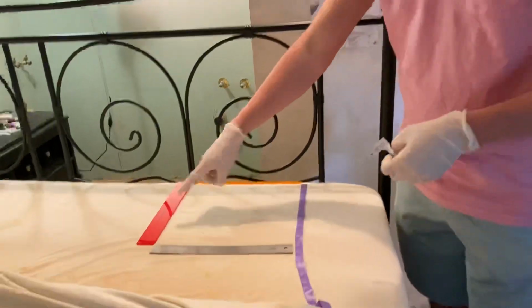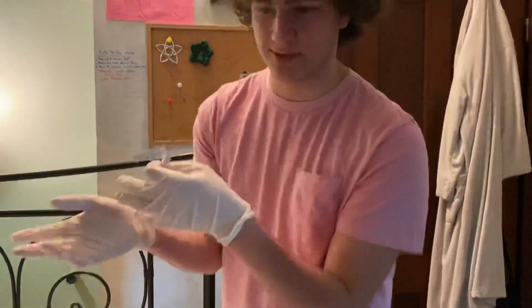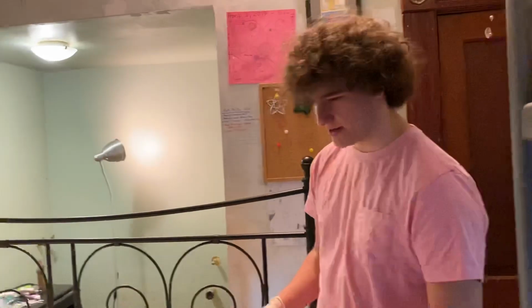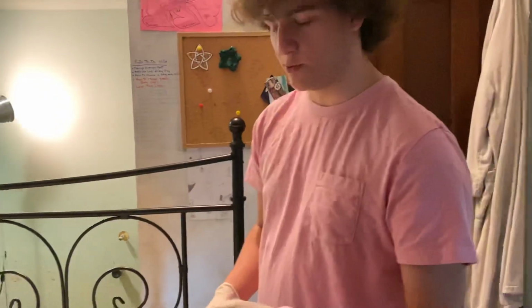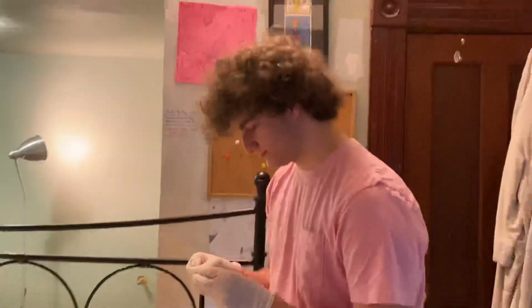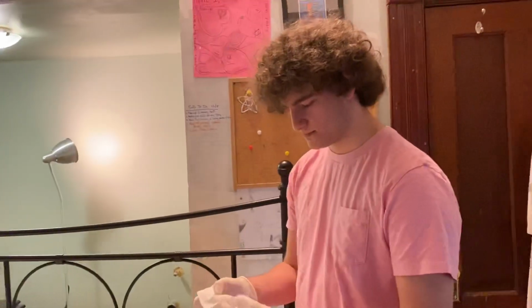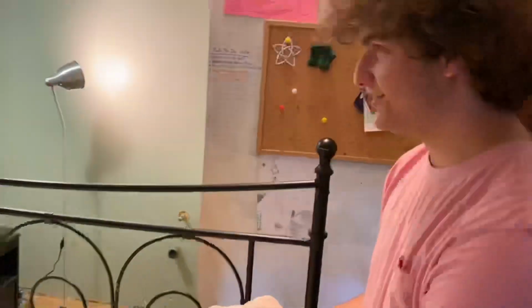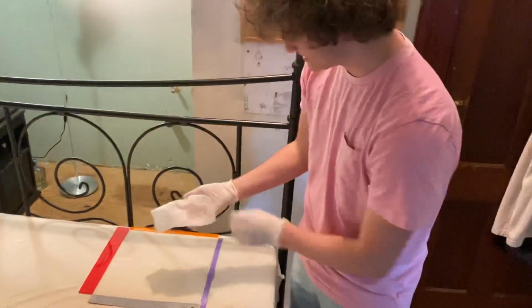So I marked off a 1 square foot area with rulers, and then I put on a different set of gloves than the one I just used, because we just did a test and I didn't want to get any contamination from the previous test area. And then I have one of the wipes that we used in the previous video, a new one, obviously. And then I'm going to completely unfold that. Like so. And then in a north-south, in an S shape around the square foot test area.